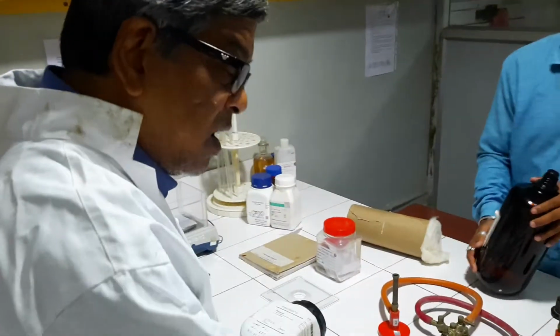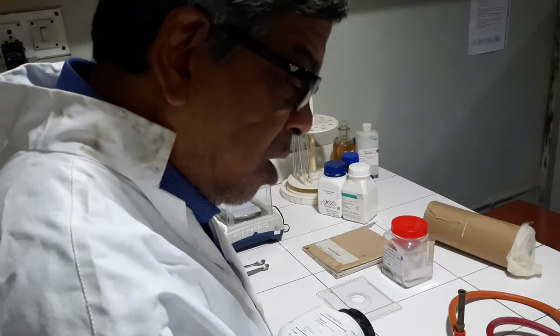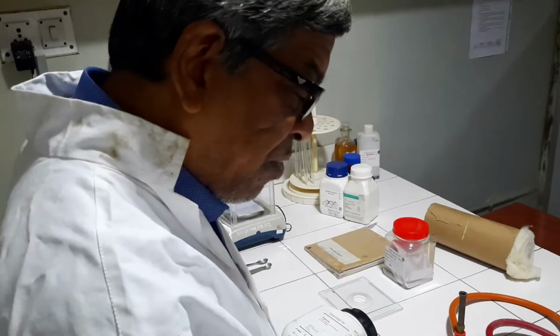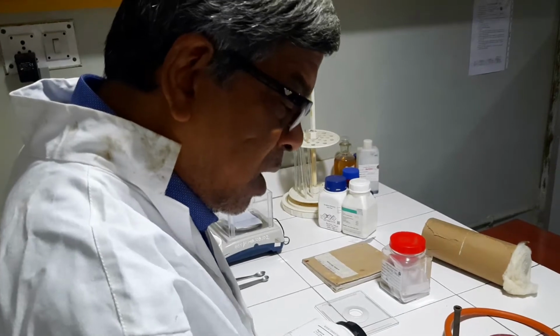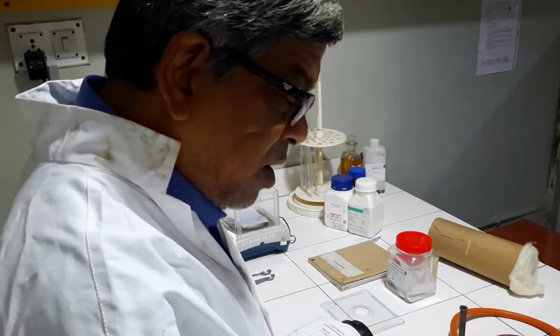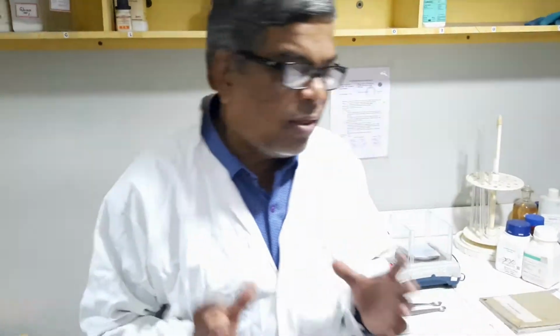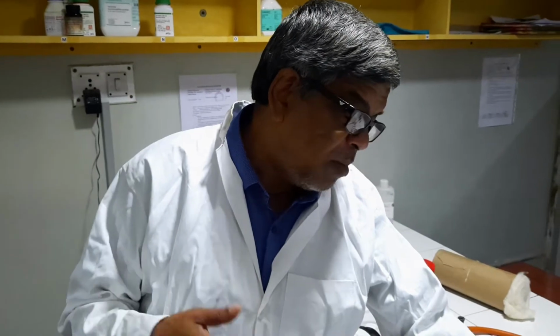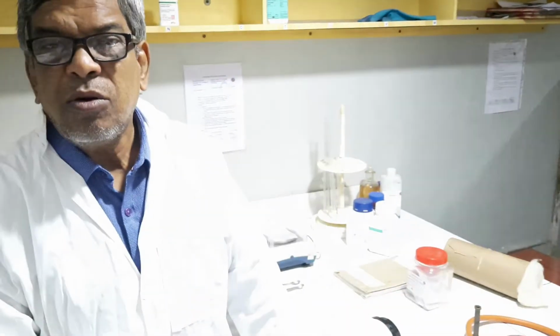The composition of the media is such that: peptone 1 gram for 100 ml, sodium chloride 500 milligram for 100 ml, beef extract 500 milligram for 100 ml. We will weigh all the three ingredients, peptone, sodium chloride and beef extract, individually and mix them only in the conical flask.